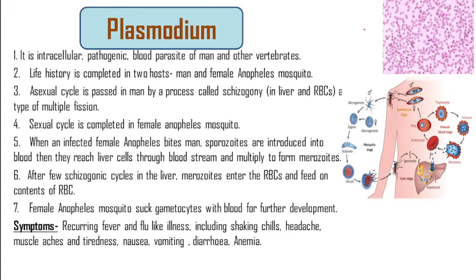Plasmodium. This kind of slide will be shown to you. You have to identify them as Plasmodium. You have to draw the diagram. Okay, so you have studied this in your theory also, when we talked about malaria. When the malarial parasite enters the body through the bite of the mosquito, the sporozoites are released. They reach the liver, then they divide there.